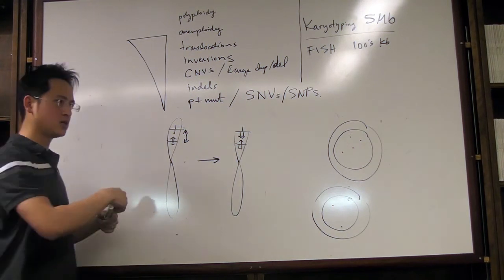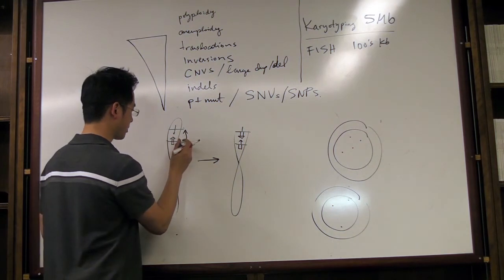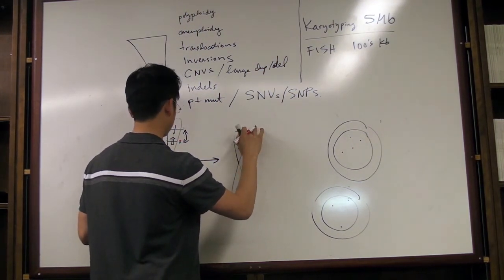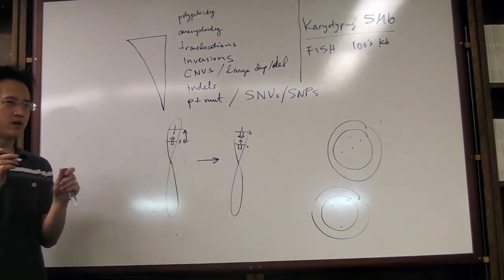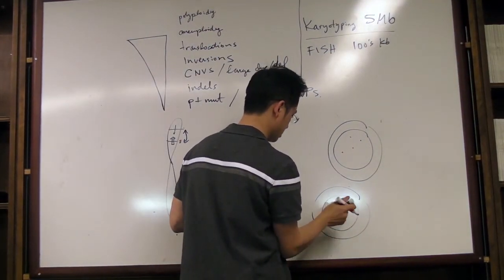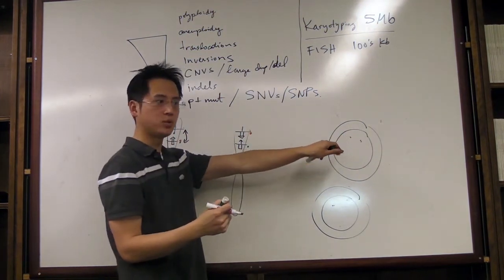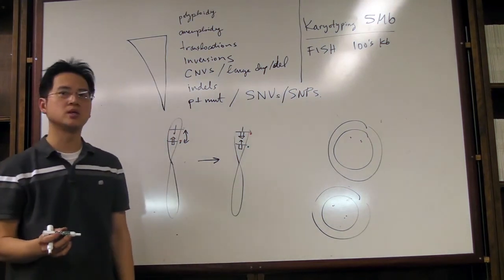So what you could do is design similarly. Let's say the big gene is where the culprit is in terms of the ALK receptor tyrosine kinase. So the green will remain here, but the red will now go up here. So you have a splitting, but it's very subtle. On FISH, you would look for something like this. So that's normal, 2 copies, diploid. The inversion was separated by about 2 probe lengths apart, maybe 3.